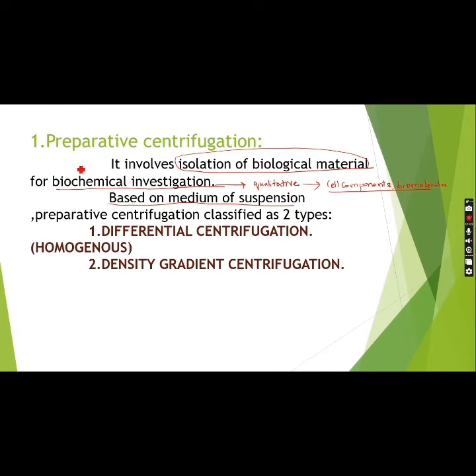centrifugation. In preparative centrifugation, the components and the biological molecules are separated, which can be used for preparation of any other byproducts further. But in the case of analytical centrifugation, a very small amount of sample can be used for identification at both qualitative and quantitative level. But in the case of preparative, it can be used for preparation and further techniques.